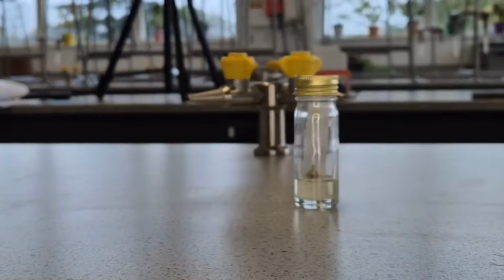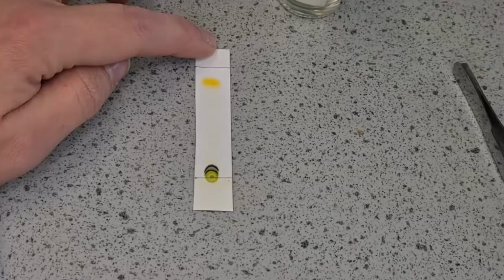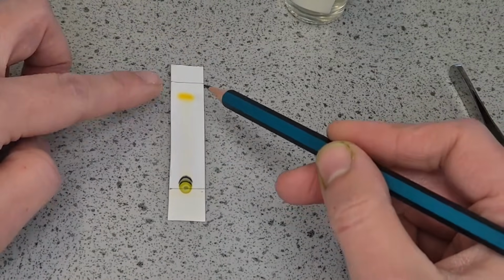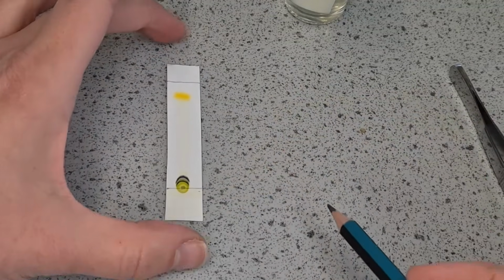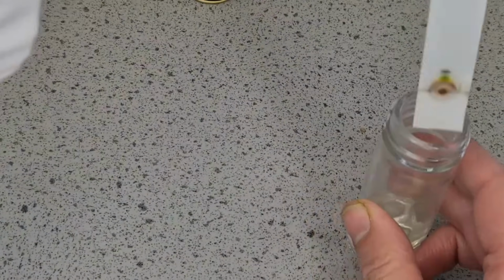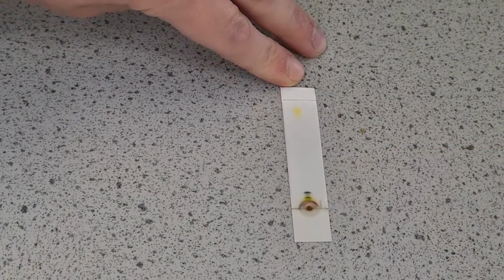Now if we just zoom in and have a look at this one before I get the next one out. So I'd still work out the RF values for those and then look at which pigments would have that RF value in that particular solvent. So that one was my spinach. So I'll do the same and take out the next one, drawing on that solvent front straight away before it evaporates.